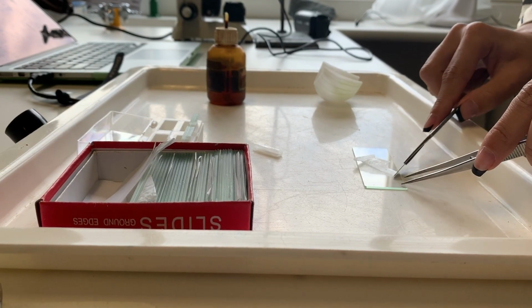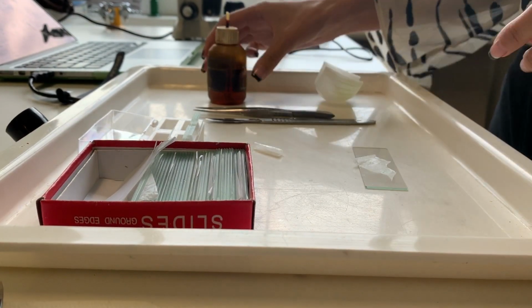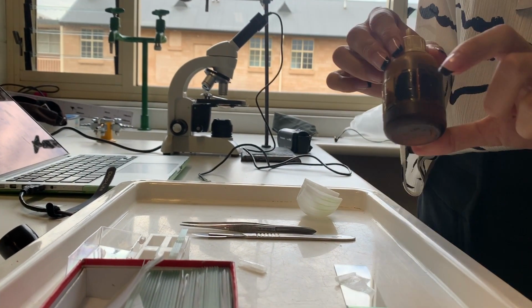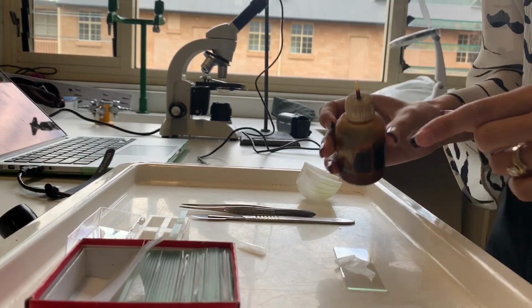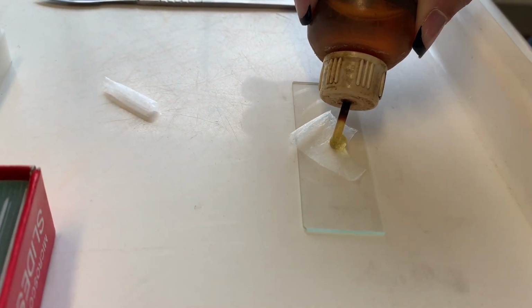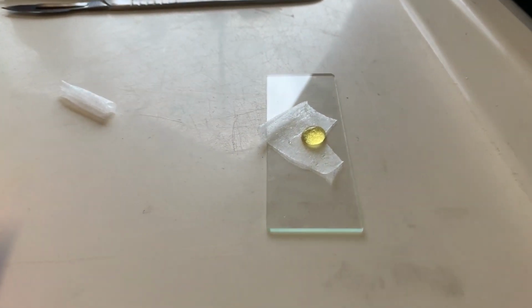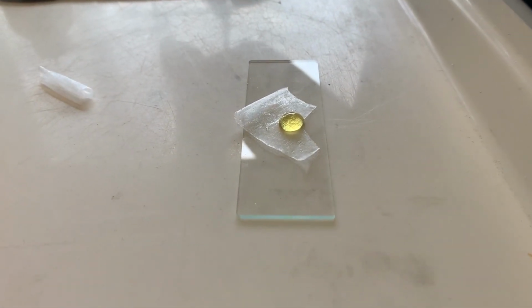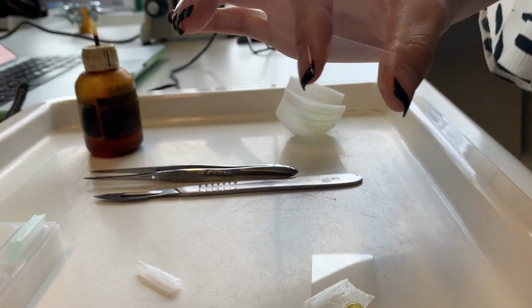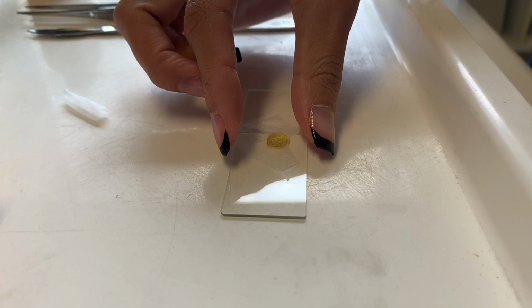So because these onion cells are pretty much white and transparent, we need to stain it, and today we're using an iodine stain here. And I'm only going to use 1 drop, maybe 2. And once I put my cover slip on, the trick here is to avoid any air bubbles, and you're going to hold it on the edges because we don't want to get any of our fingerprints on the cover slip itself, and we just lay it down.